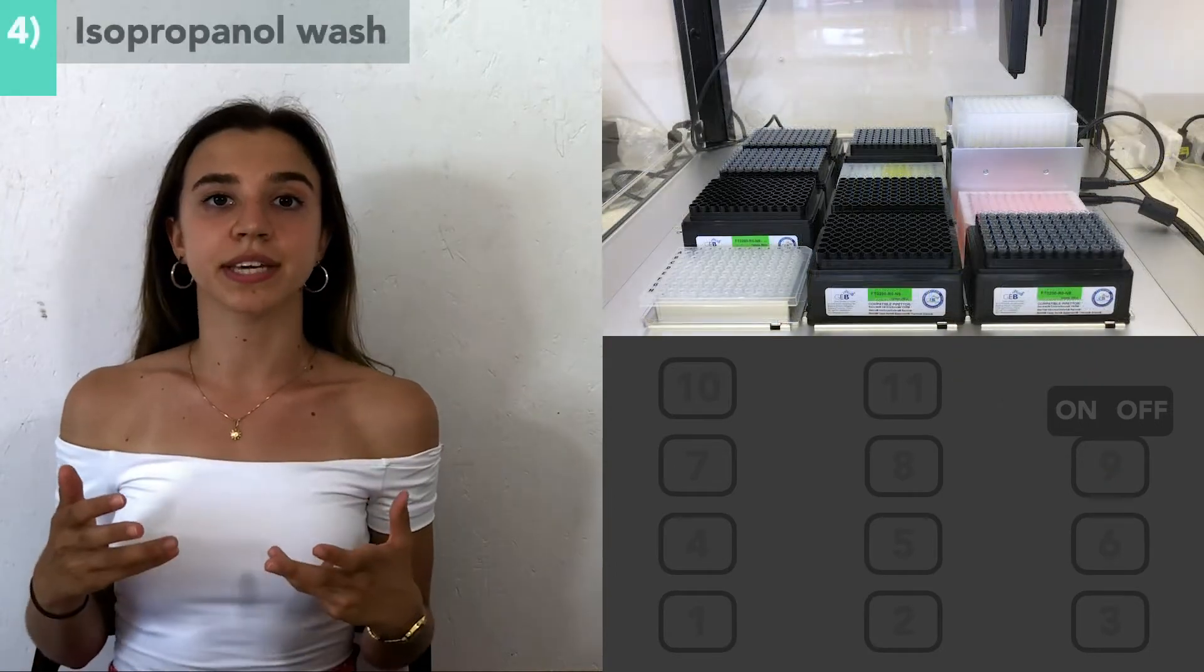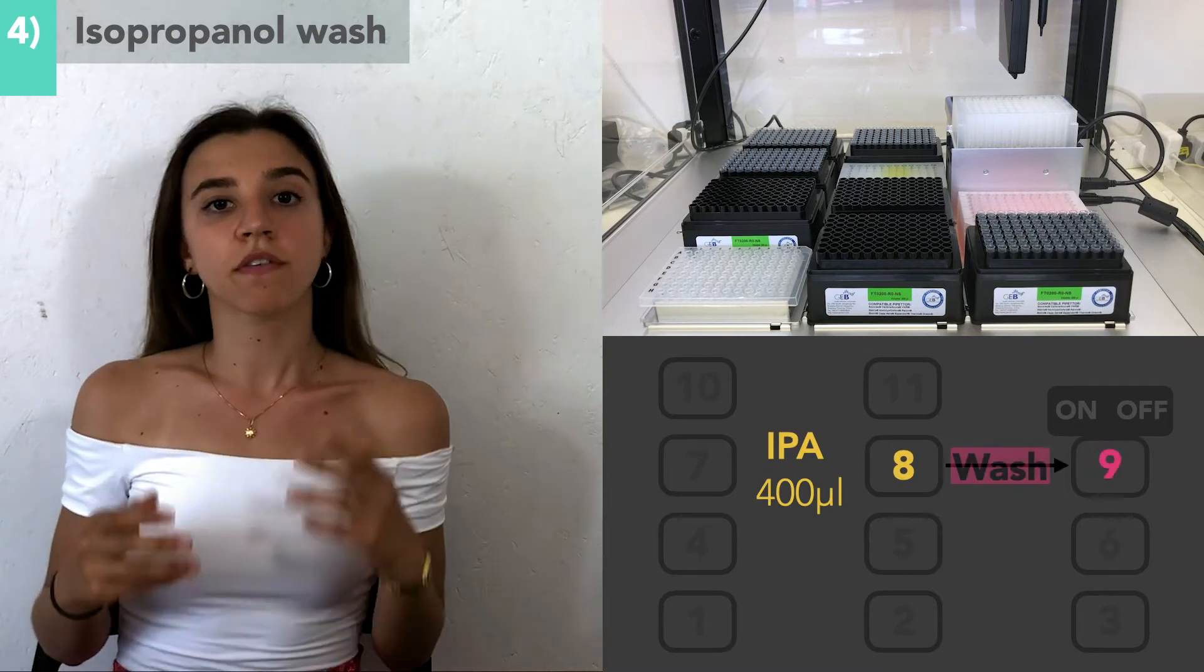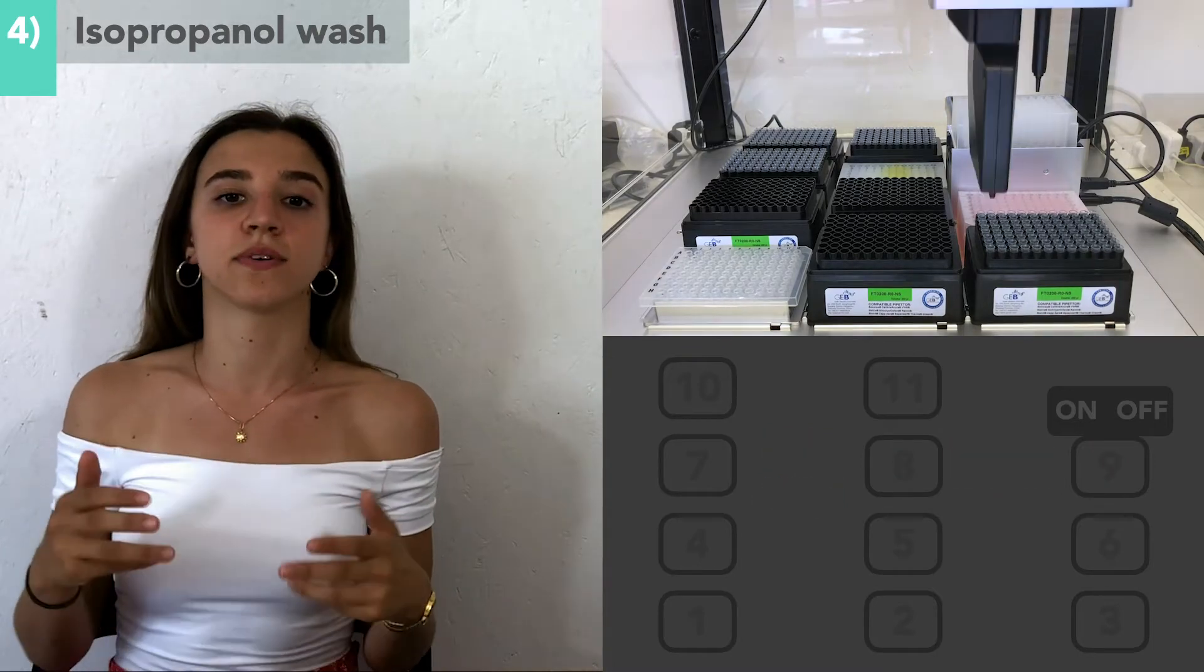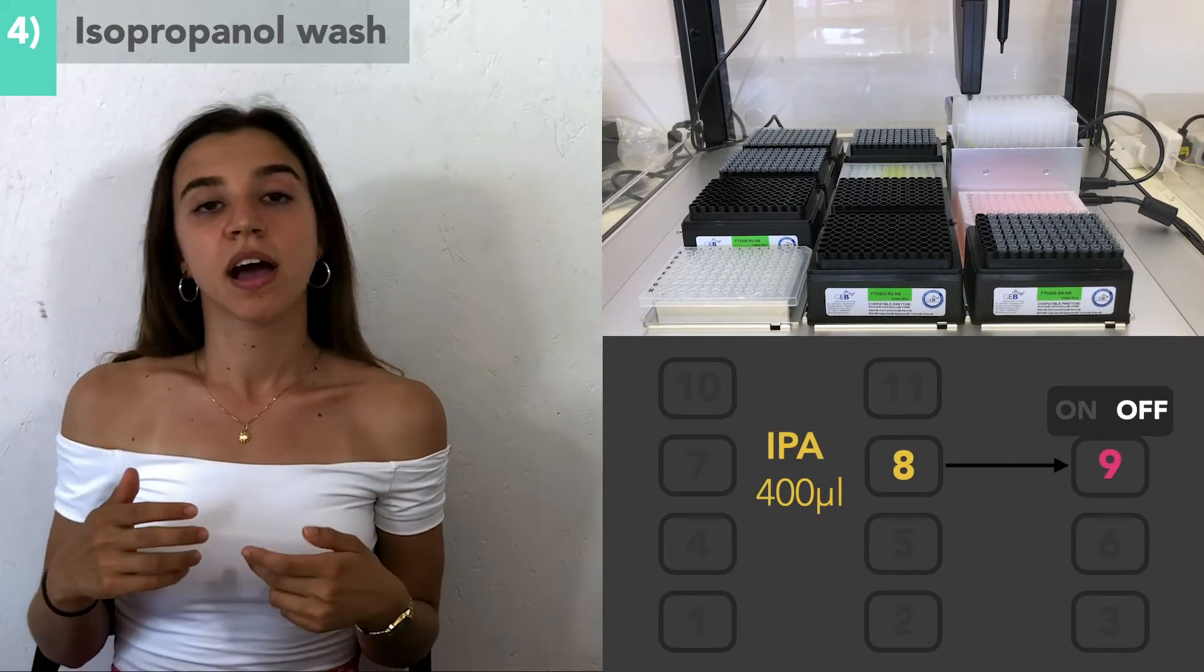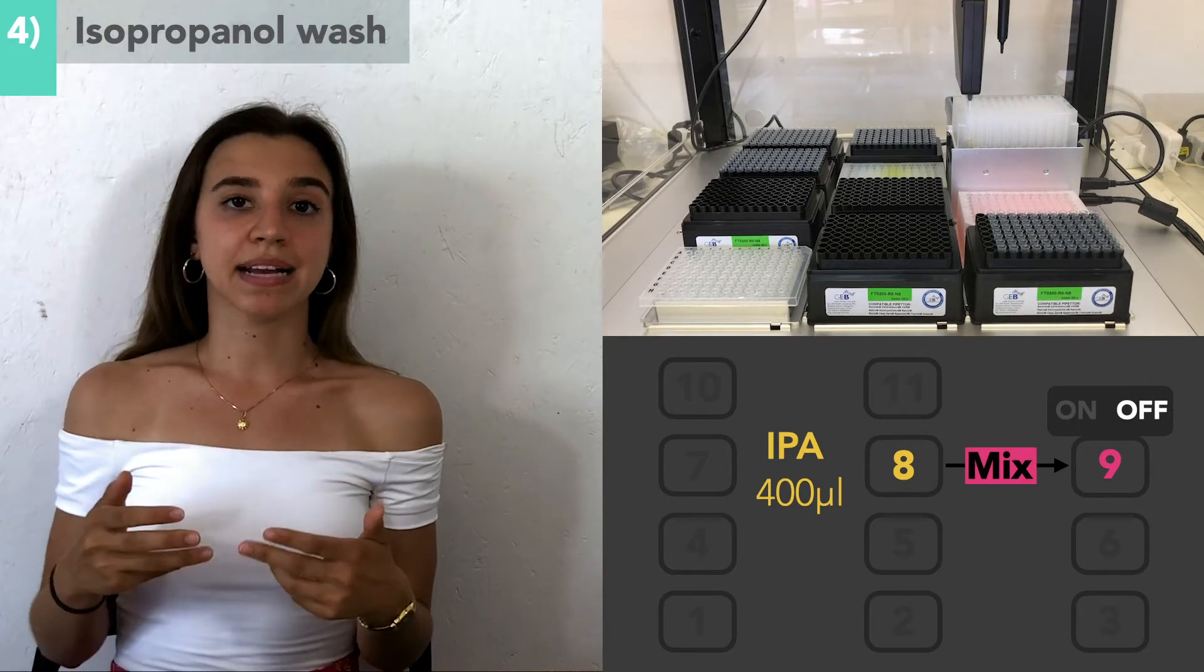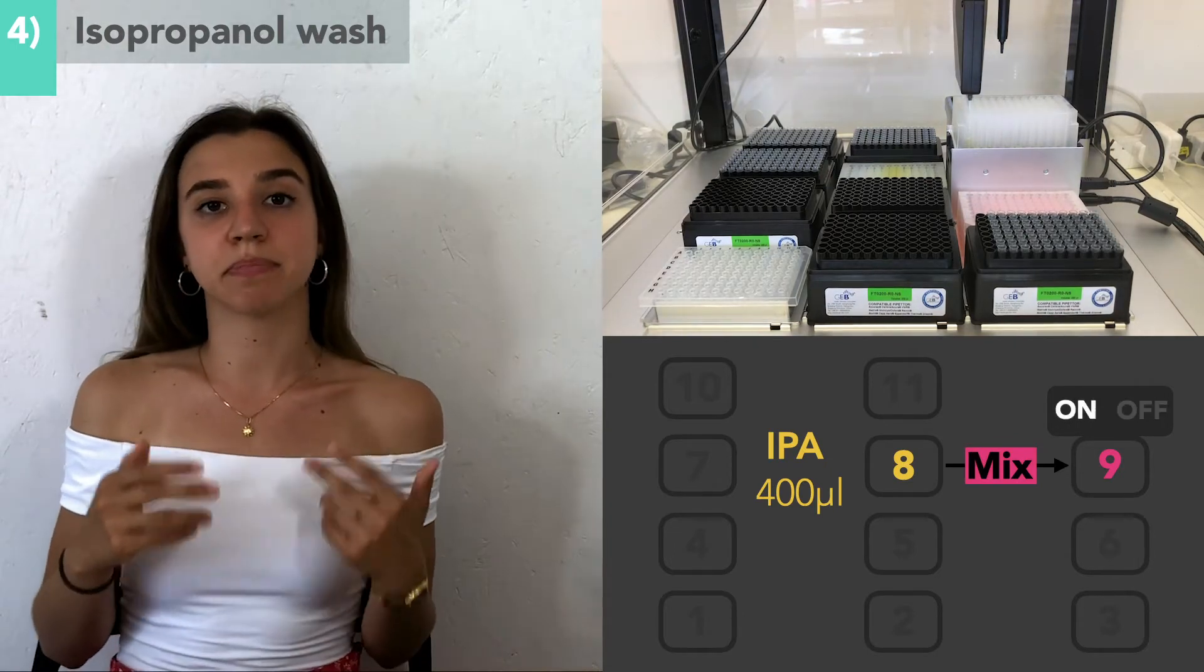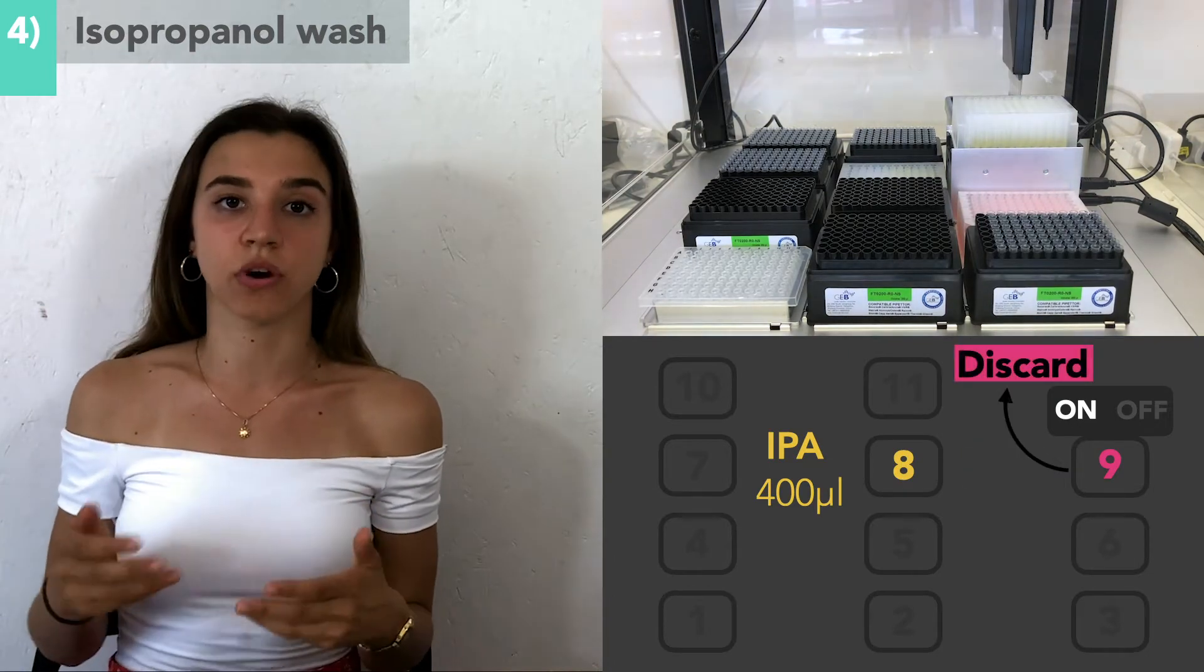The first washing stage is done with 400 microliters of isopropanol. For each wash, the process is as follows: the magnet is turned off, isopropanol is then added, the solution is mixed by pipetting up and down, the magnet is then turned on to attract the beads to one side of the well, and then the supernatant is discarded.